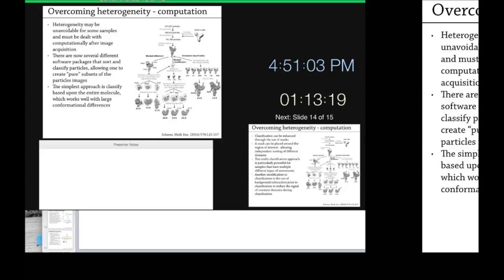Any other questions? Because this is to me the most important part, is how you get your data set and how you manipulate it. This is where I spend almost all of my time, and I work with my people to try to come up with the optimal ways and to test different ways, because just because someone's had an algorithm that worked really well for one data set, it's not necessarily going to work for the same data set, even if they're very similar proteins. Because they all behave differently, and even one data collection set to another can behave a little bit differently.